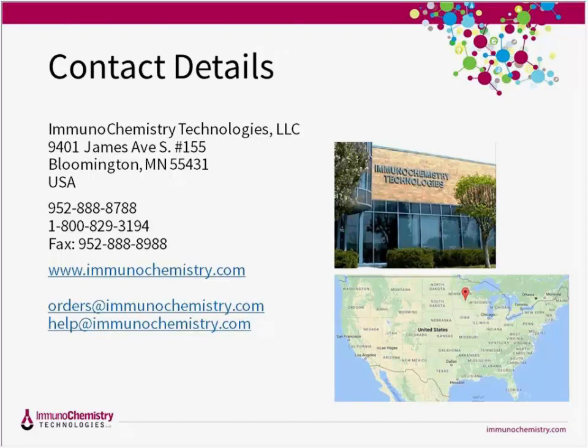Thanks, Tracy, and thanks to everyone who submitted questions. We have time for a few of them. Question 1, are FLICA products species specific?